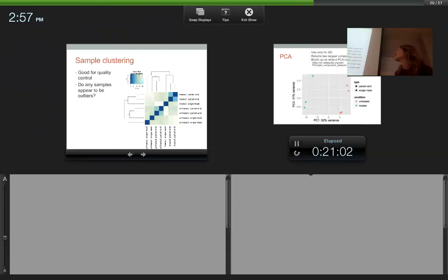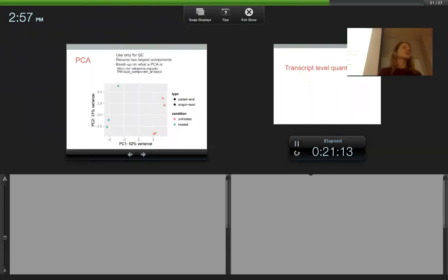Oh yeah, like I was saying, you can get hierarchical clustering, and these make really pretty figures for your papers to see which of your samples are the most similar. And of course, you can always do PCA plots, which are great for exploring the overall variation in your data. More descriptive statistics than quantitative, but it's kind of nice because a lot of this is wrapped inside the software package, so we'll see that.